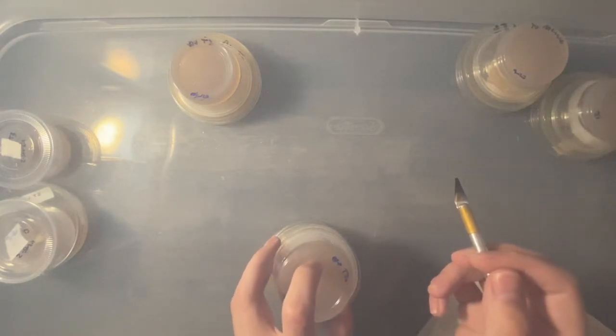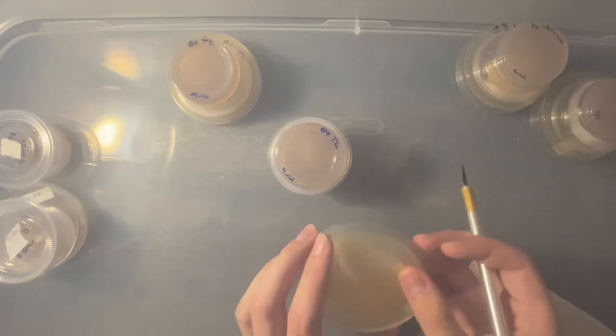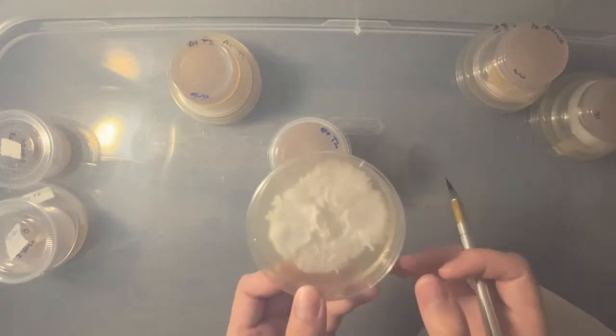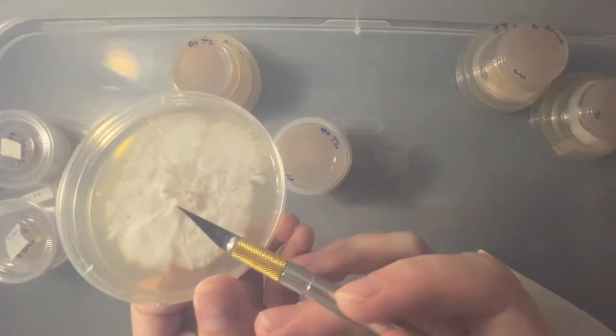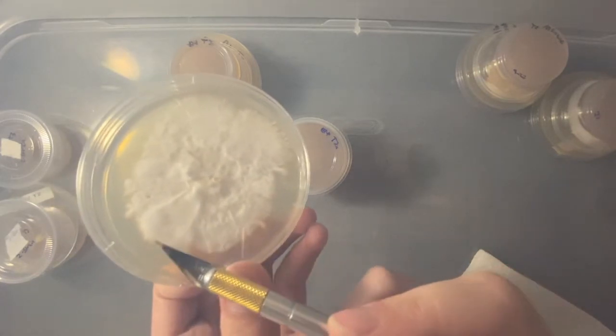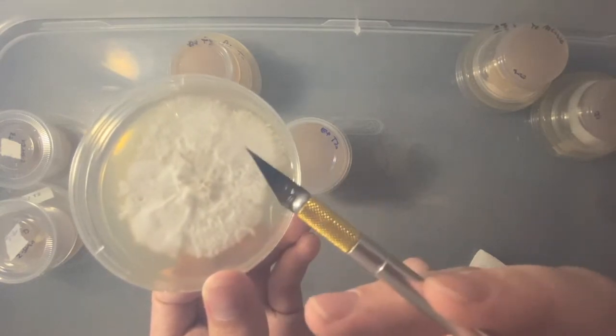And I just go through, clean up anything that's contaminated, or do transfers to improve genetics. This one I've let go for almost a month. But yeah, that's some mycelium piss in the middle, right there. So I'm gonna transfer this right here, and maybe over here, I don't know.